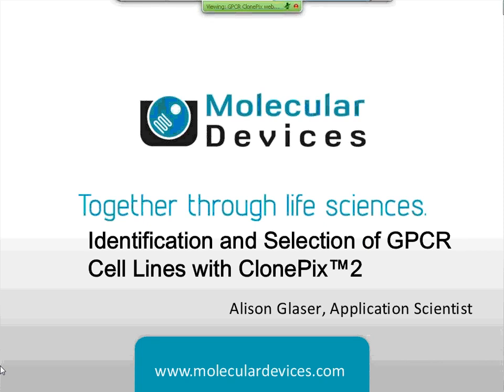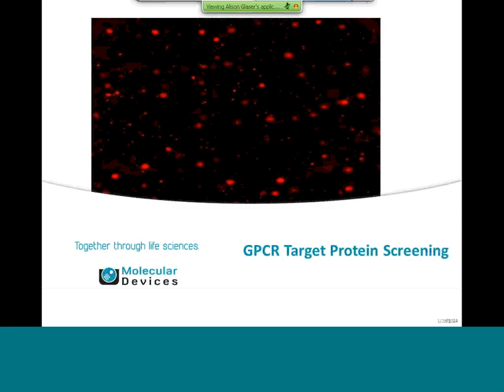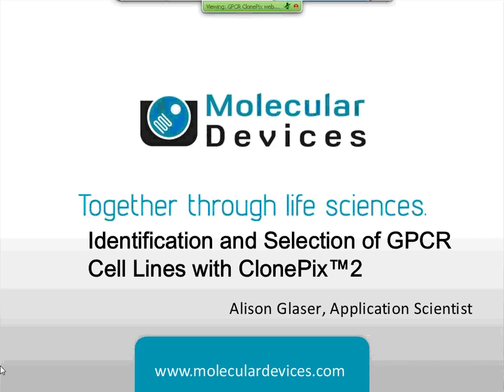I received one question. For the functional response on Flipper, how difficult is it to transfer the clones? I suspect that means how difficult is it to transfer the clone from one plate to another for the read on the Flipper system. It's not difficult at all. It's just a simple pipetting step of just monitoring for confluence to make sure that they're viable and confluent enough, and then just transferring them onto a 384 well plate. Please type in a response if that does not answer your question.